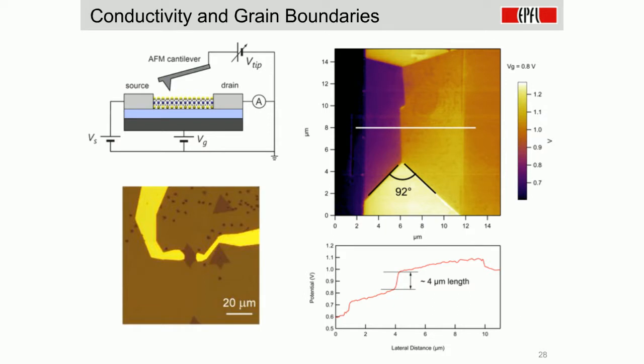If you look at the line plot, you can see how much this discontinuity represents in the potential drop. What you have here is a grain boundary. These two grains have a non-highly symmetric misorientation, misoriented by 92 degrees. In that case you get a grain boundary which contains a lot of voids, and these voids lead to extra electrical resistance, which manifests itself as a large voltage drop across these two grains. So that's the discontinuity in the middle.